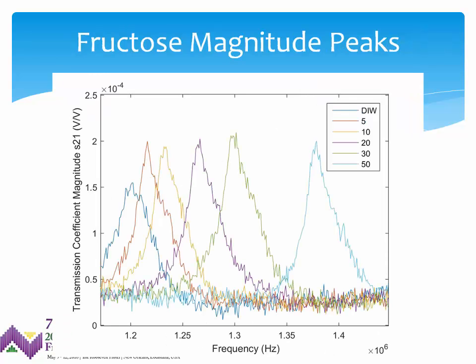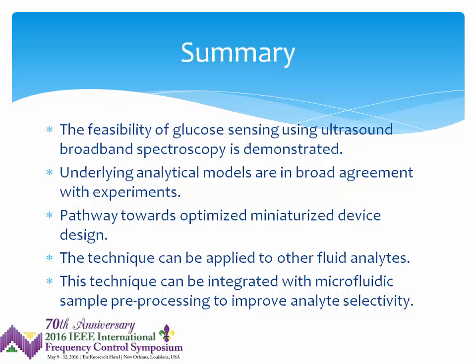So then application to other types of analytes. Again, this is a technique that could be applied widely to other analytes as well. So for instance, fructose shows a very similar sort of response. Okay, so with that, I think I'll summarize the results here.